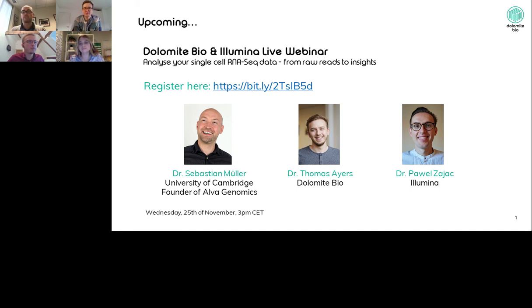So I could maybe respond generally, and then maybe Tom can talk about the Nadia. For me, this is one of the issues that I find constantly is the biggest problem, and it stems from getting very good live cells or good nuclei from an experiment. And really the best quality data that we've got always tends to come from a FACS sorted based method. If it's a single cell suspension from blood, it's very easy. We don't have any issues. The issue that we see a lot of the time is when they're more difficult to extract, or they clump. FACS sorting or trying to remove that debris is what I can only suggest.